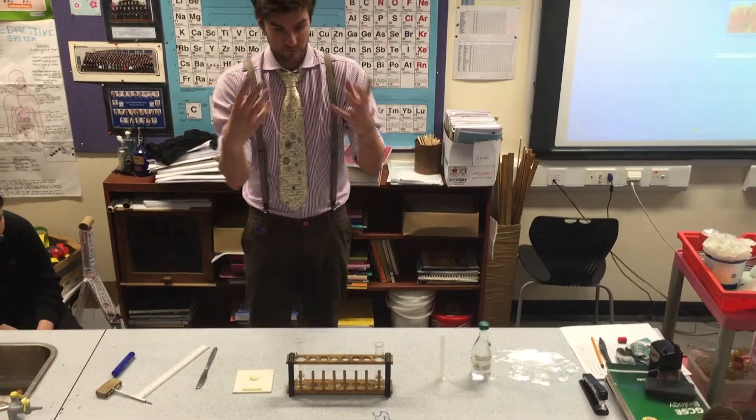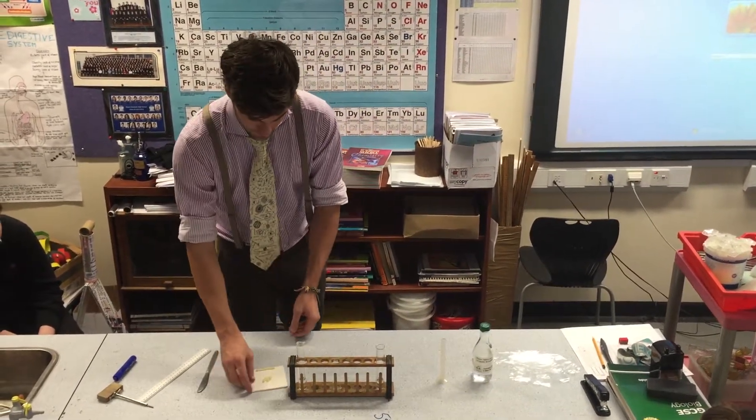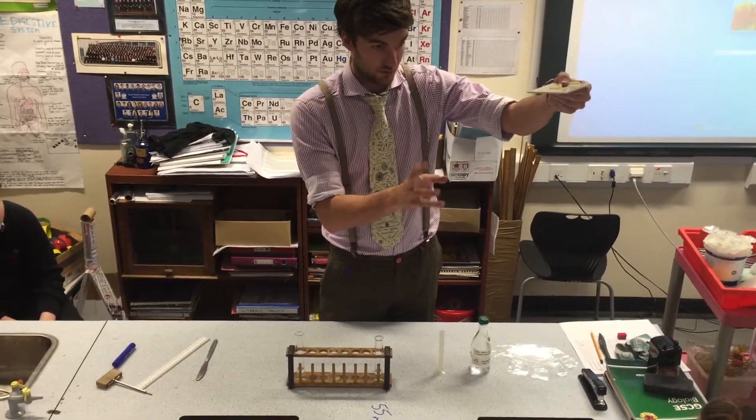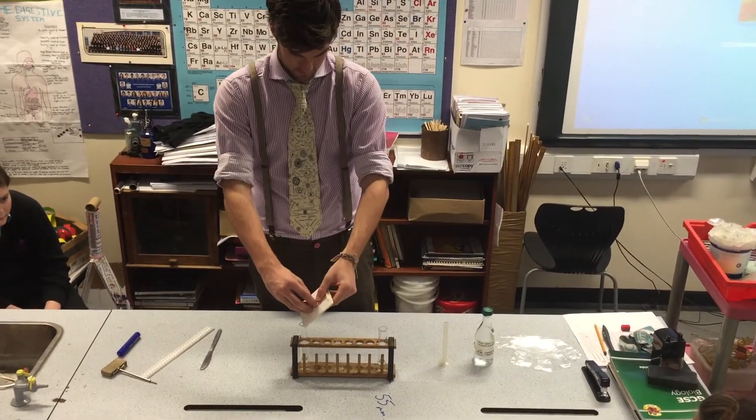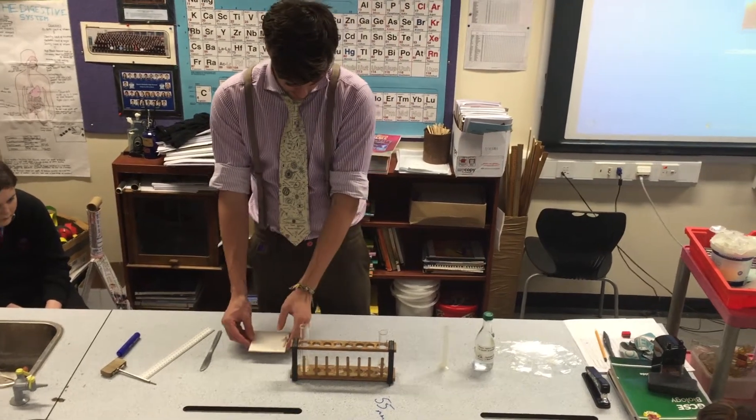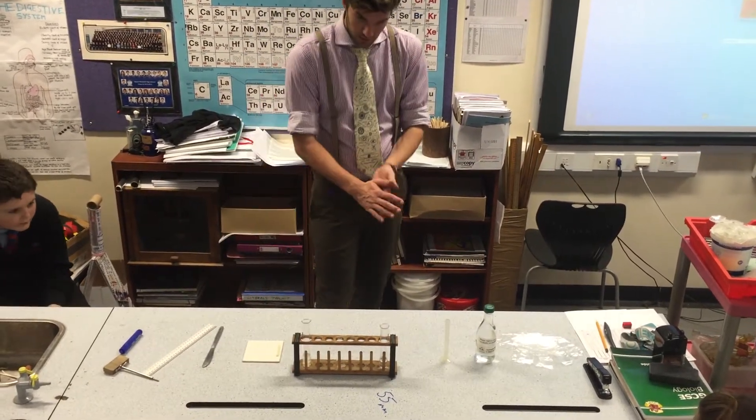You're going to place your chopped potato first into one. So there's one. You're going to leave it. What is happening now?